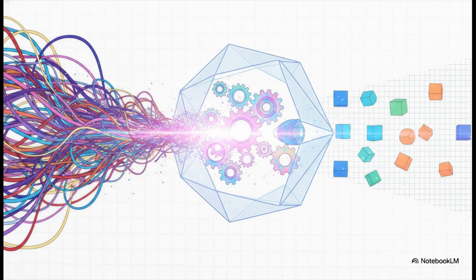Now, dealing with waves and delays gets mathematically messy very quickly, so our detective needs a decoder ring. In electrochemistry, that decoder ring is a mathematical translation tool called Euler's relationship. This formula is brilliant. It lets us convert those raw, phase-shifted oscillating signals into a single complex function. So suddenly, our impedance is represented as a complex number made of 2 distinct parts, a real part and an imaginary part. And hey, imaginary doesn't mean it's fake. In physics, the real part is your direct, straightforward resistance, while the imaginary part represents stored energy and those out-of-sync delayed responses. Using Euler's relationship, we've successfully translated raw electrical echoes into usable, distinct clues.